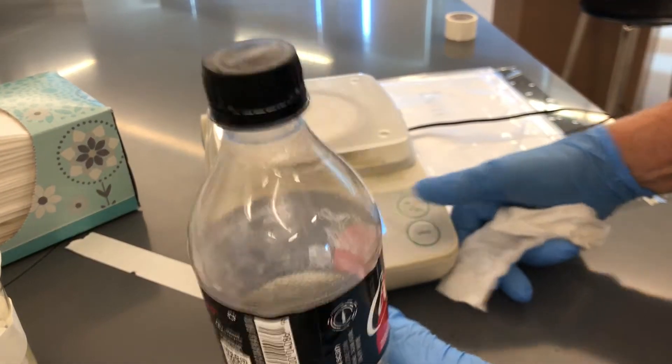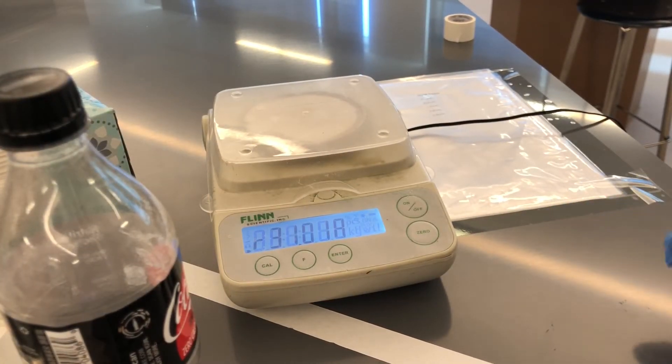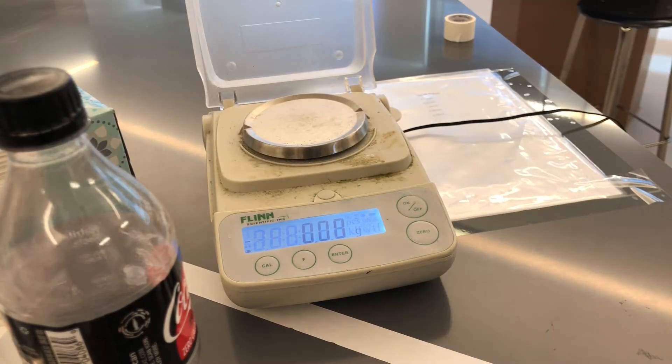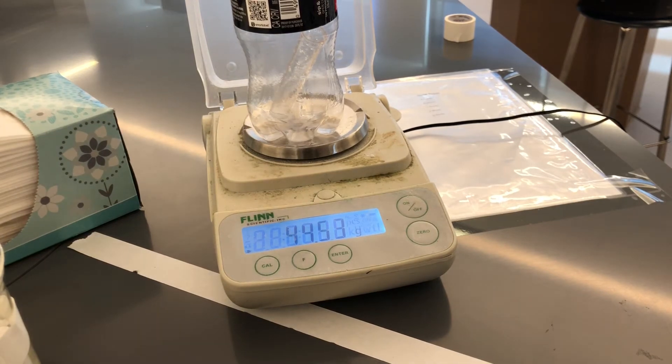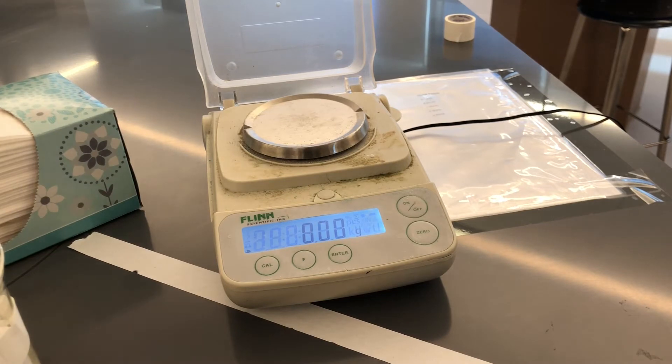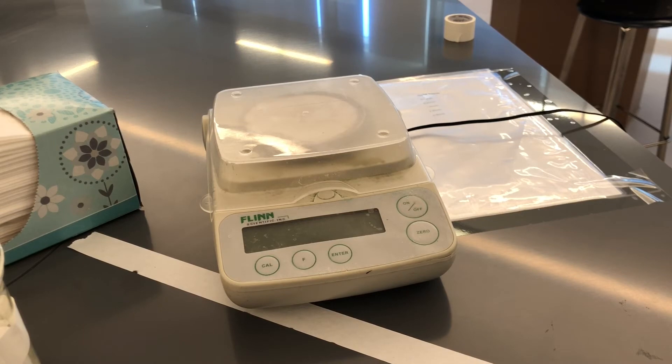Let's turn the balance back on. Make sure it goes back to zero, and let's see how we did. 44.54 grams. Now you have to decide whether or not we're able to prove the law of conservation of mass.